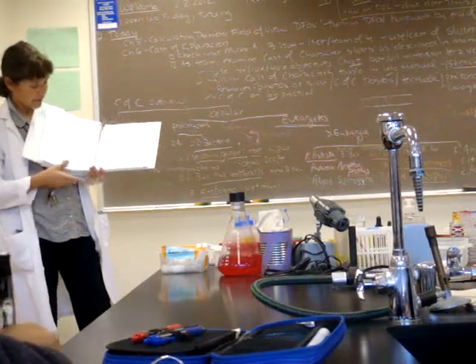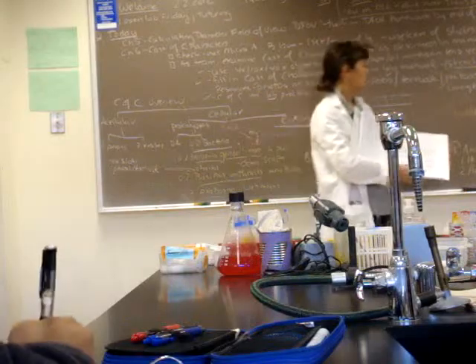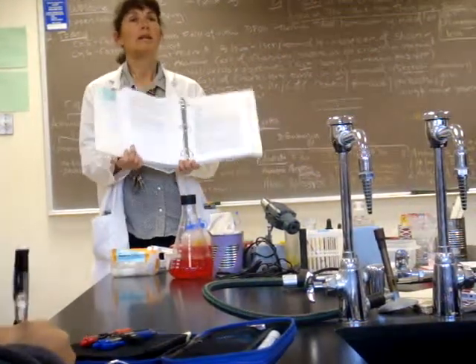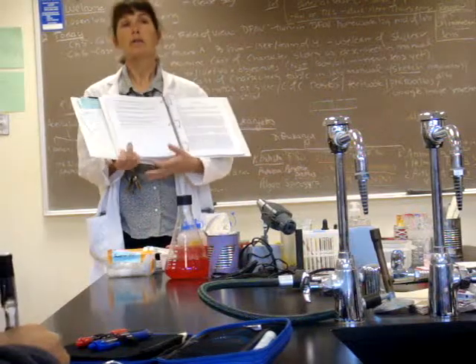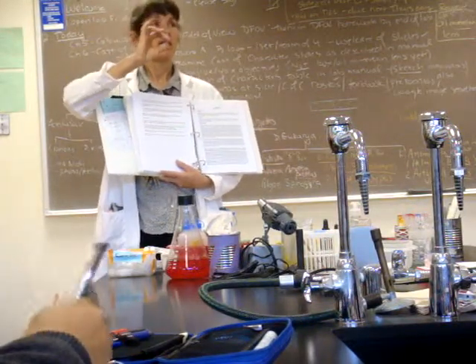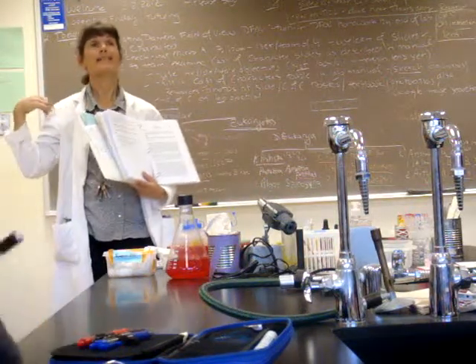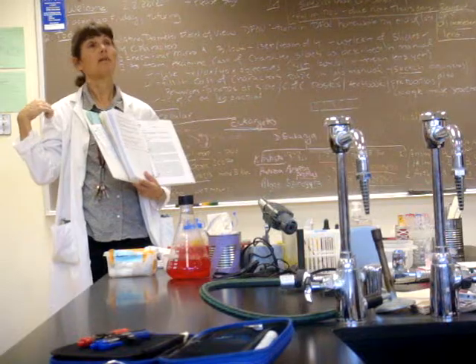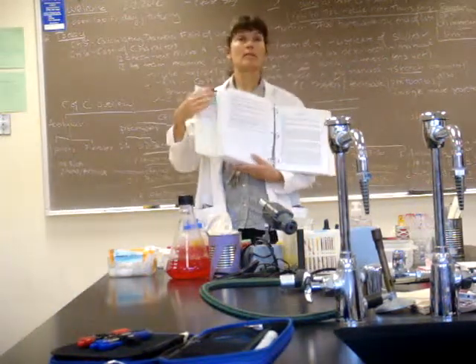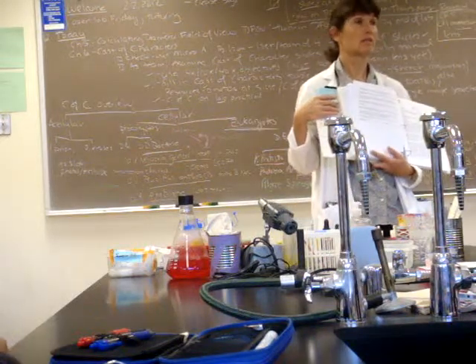Just two more to go, you guys, on my page 60. We move to members of kingdom Animalia. You'll be looking at a helminth or a worm. This is Taenia solium, the pork tapeworm. What you're examining is an immature worm that forms a cyst in muscle, the muscle of pigs, pork. This immature Taenia is called a cysticercus.